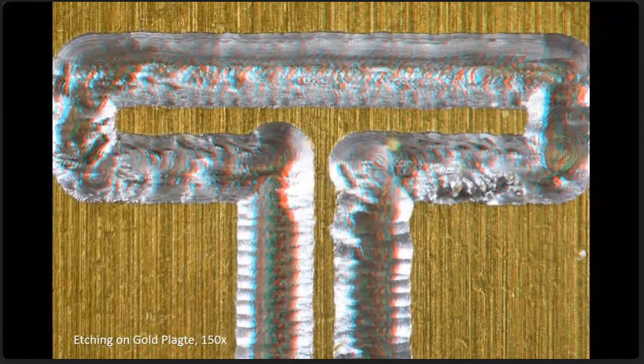Here's an example of microelectronic circuitry. You're seeing it all in focus and all in 3D. Here's an interesting one, some very fine etching on a gold plate. This is a polished gold plate. You can see the polishing marks on the gold. And then you can see all the little bits of etching and you can see where the tool cut nicely and where the tool didn't cut well and how it left material behind.